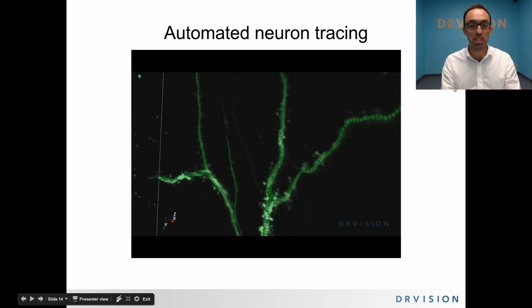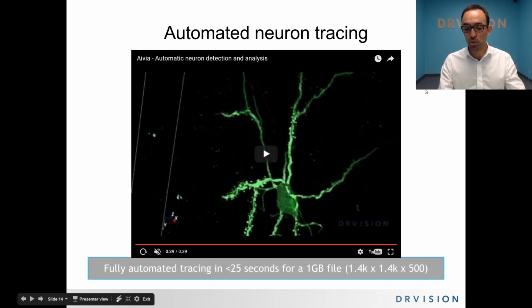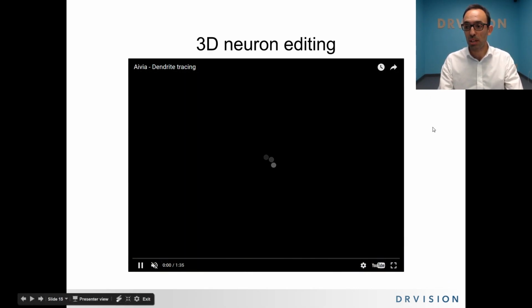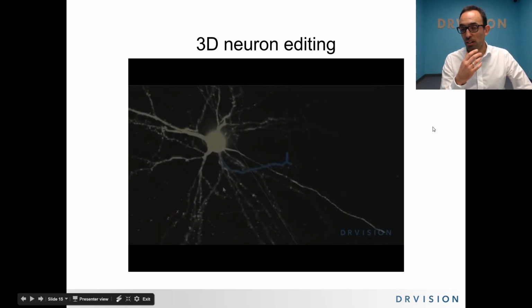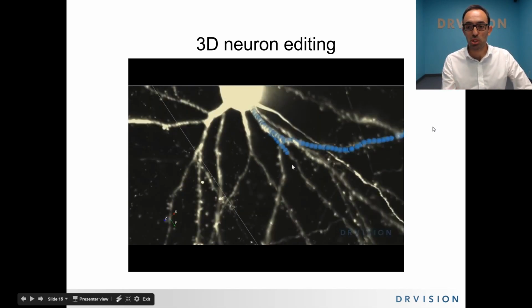There's always limitations. And so we have added a tool, the dendrite pencil I mentioned already, that will allow you to look at a data set that is already analyzed or semi-analyzed, and then you can add traces. And that's what I'm showing here in this brief video.